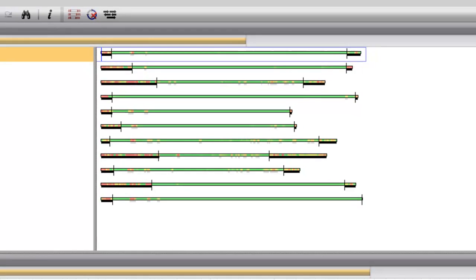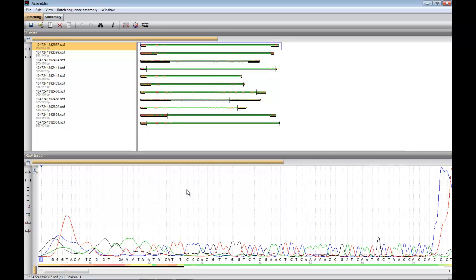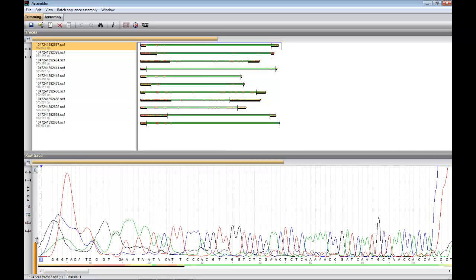The bottom panel shows the raw chromatogram file. Zoom sliders allow you to zoom in on the curve horizontally or vertically.